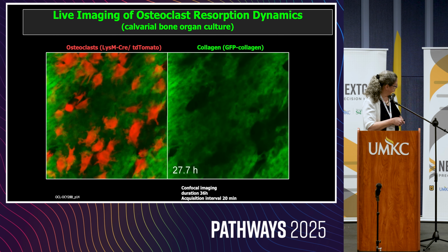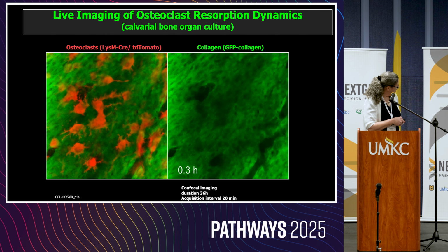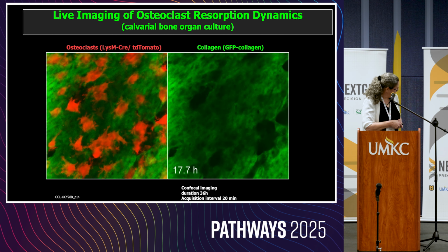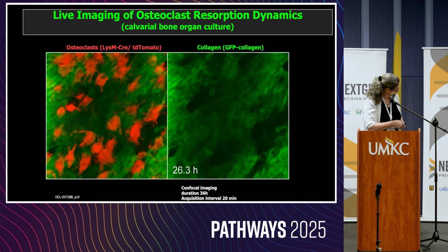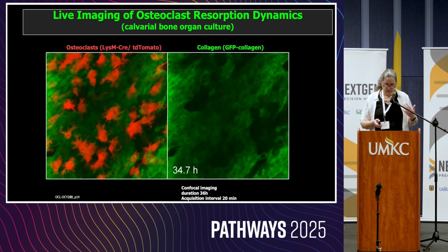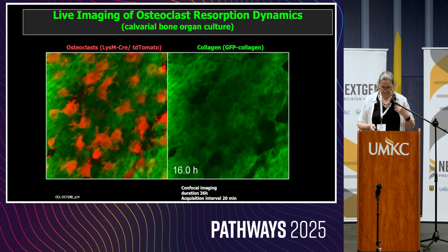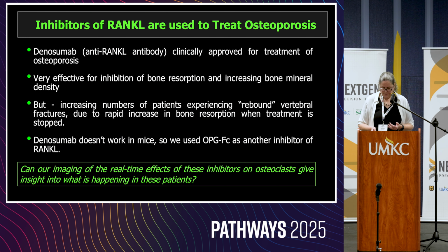And we see a lot of interesting cell dynamics here, where a large osteoclast splits into 2 daughter cells, and then there's a fusion event here where this osteoclast fuses with that other cell. So we see a lot of interesting cell dynamics, and we can look at the real-time dynamics of resorption.